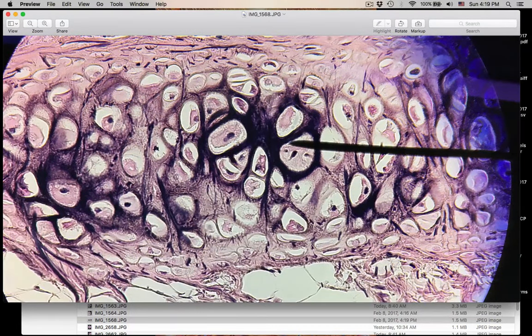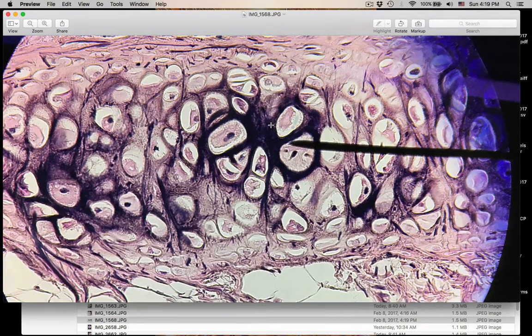Number nineteen is elastic cartilage. You know it's a cartilage because you see the lacunae. Where do you find elastic cartilage? Think of the E's: elastic cartilage — external ear and the epiglottis. That's where you're going to find elastic cartilage. That was number nineteen.